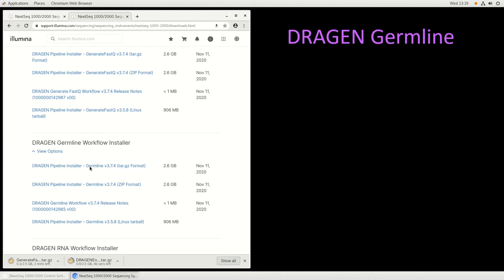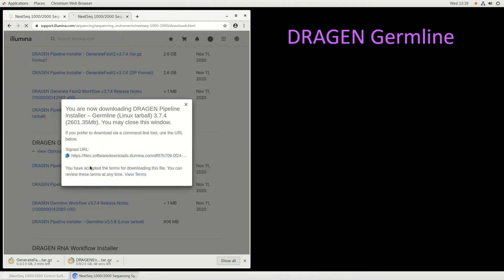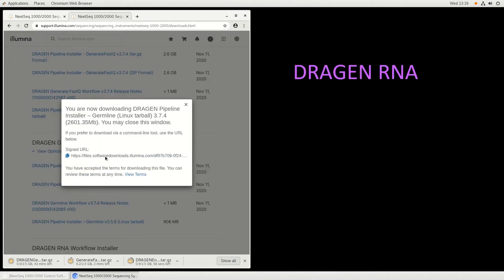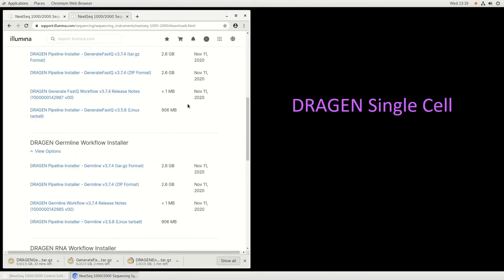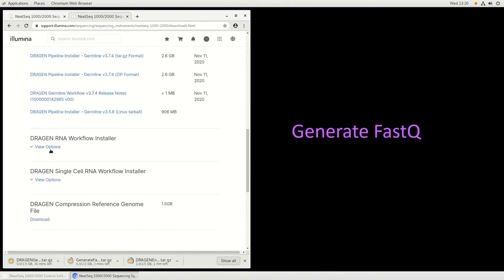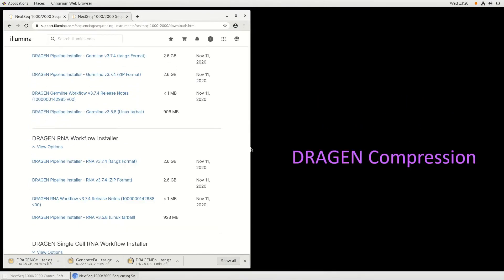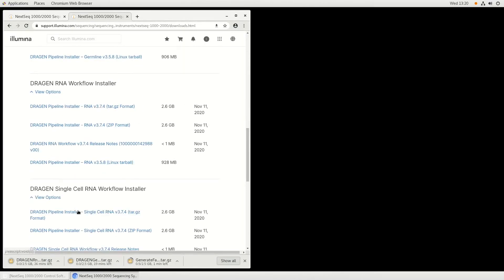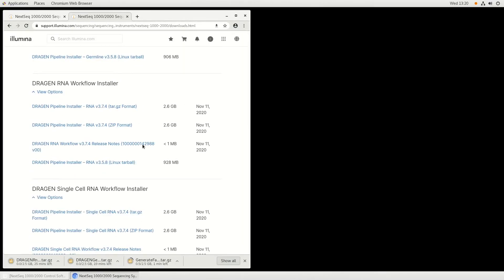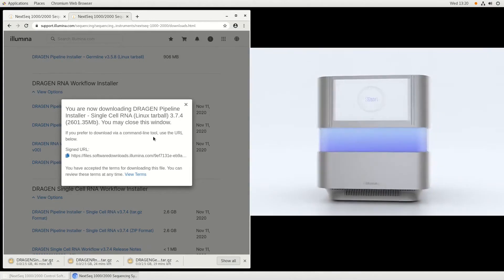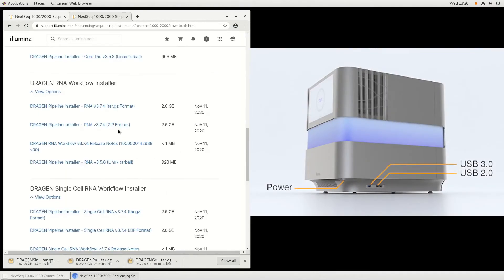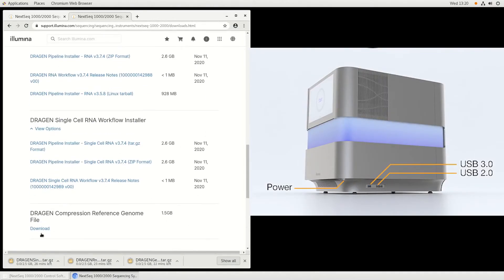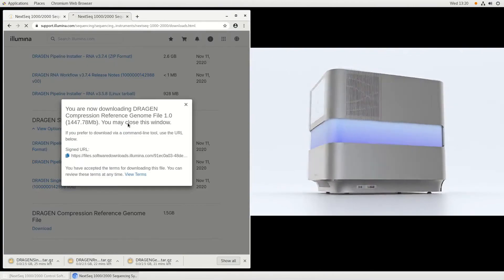Repeat the preceding steps until Dragon Germline, Dragon RNA, Dragon Single Cell, GenerateFastQ, and the Dragon Compression file are all downloaded. If the files were downloaded on a separate PC, copy the files to an external hard drive and plug the drive into a USB port located on both the side and back of the instrument.